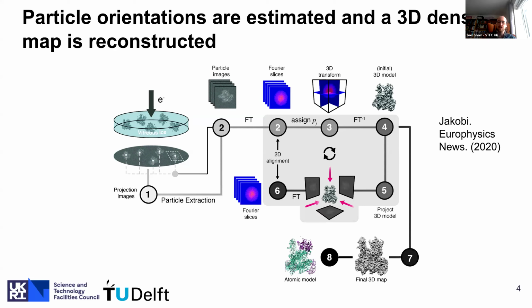This means that we can use the estimated orientations for each of the particle projections, and compute the Fourier transforms of our particle images, use those along with the orientations that we predict for each of these particle images relative to each other, and piece them together to form a representation of our Coulomb potential of the macromolecule.